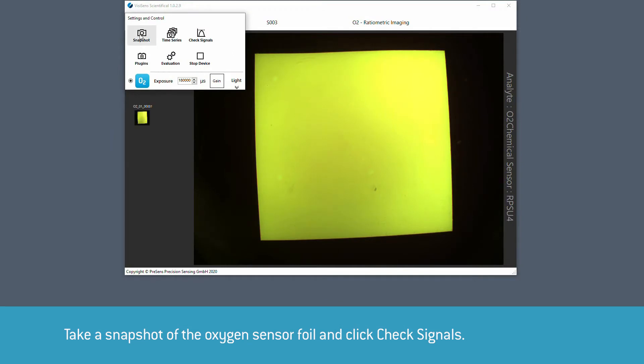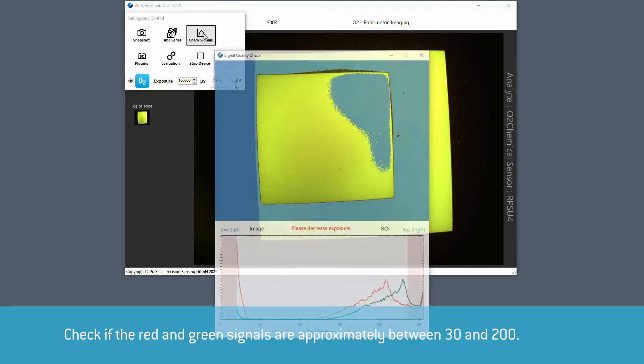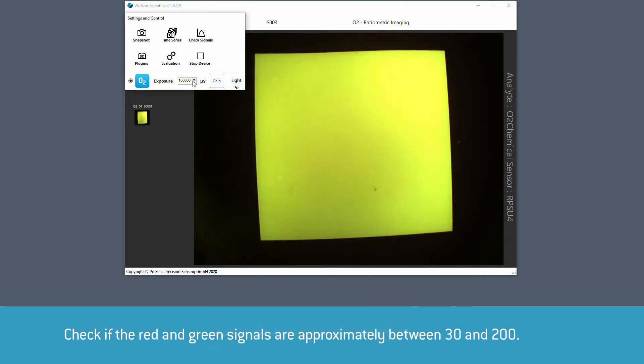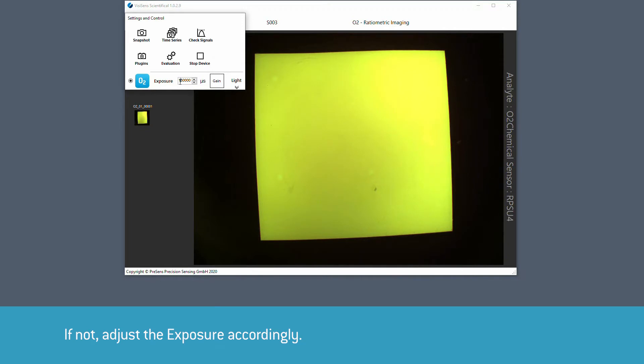Check if the red and green signals are approximately between 30 and 200 in the graph that opens. If not, adjust the exposure accordingly.